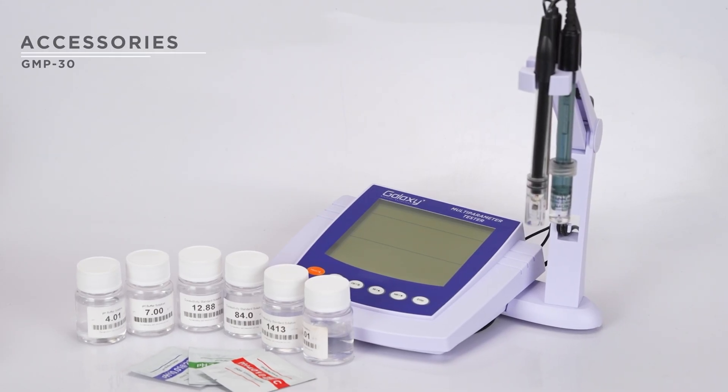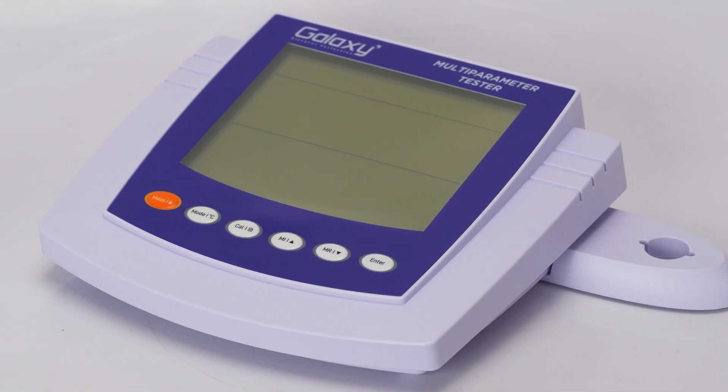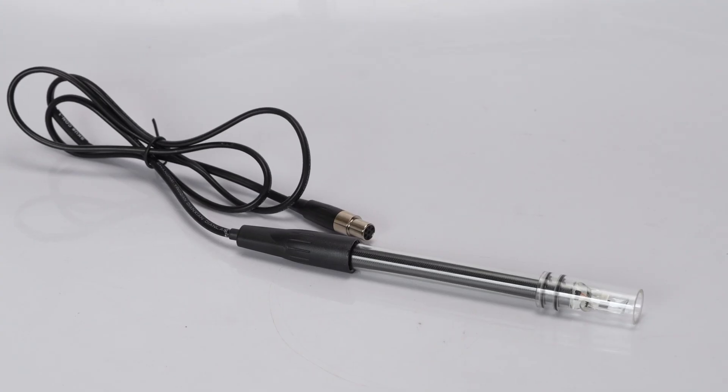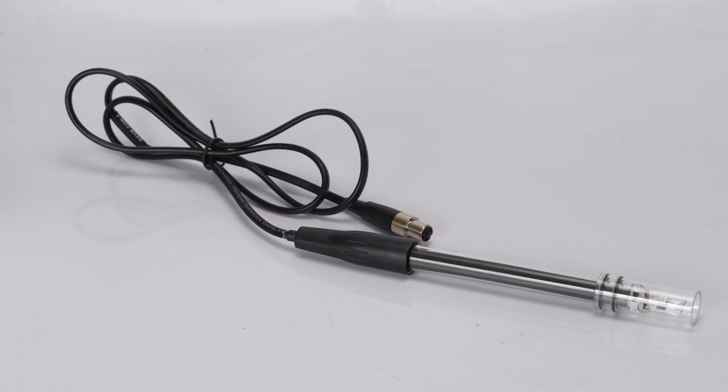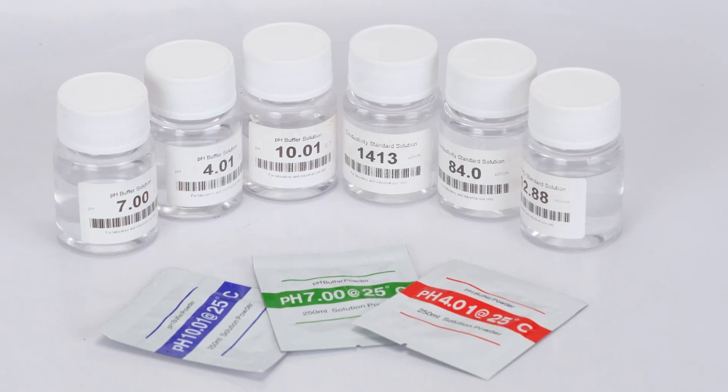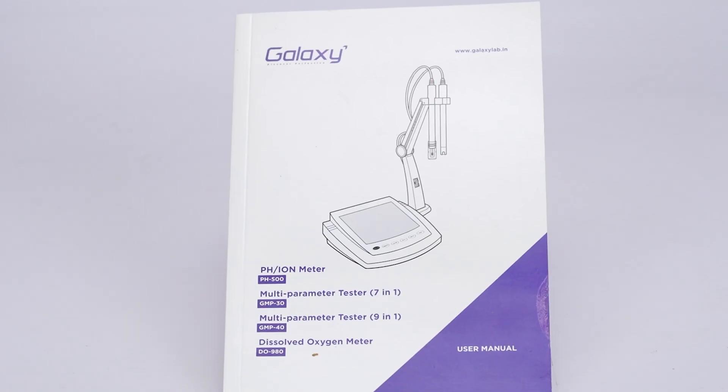Each GMP30 meter package includes a main unit, pH electrode, conductivity electrode, temperature probe, power adapter, standard buffer, and user manual.